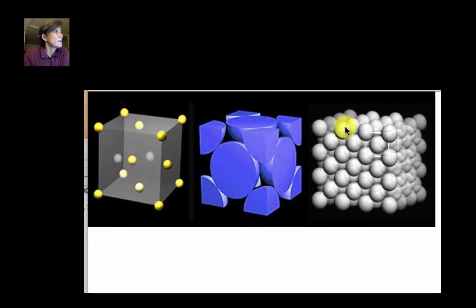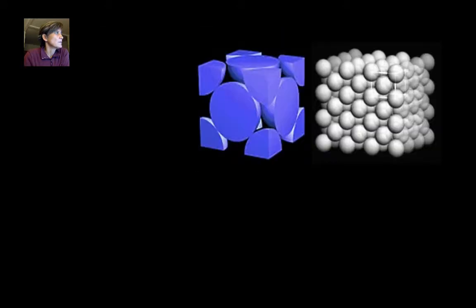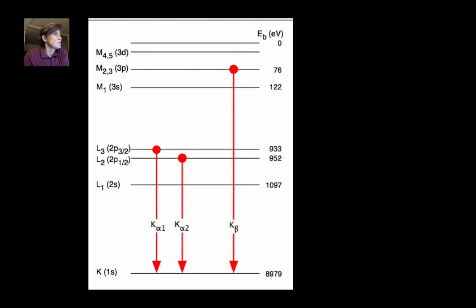And we came to this idea that the X-rays, the characteristic X-rays, come from transitions inside a single atom, near the core of the nucleus. So they're at a level that's more like this, I guess, if you were thinking of the atom as kind of a sphere.